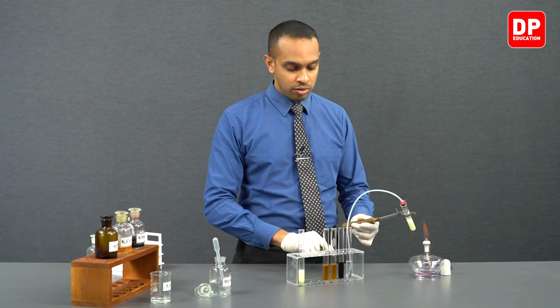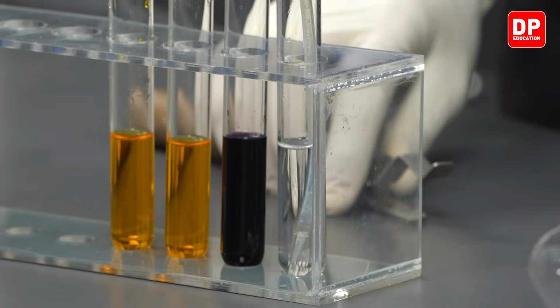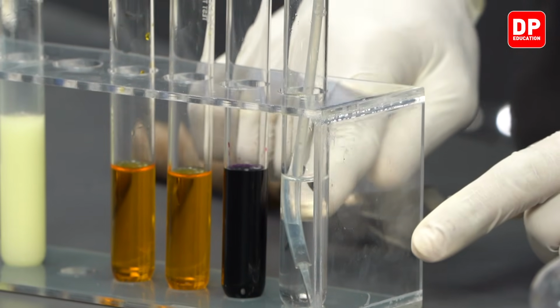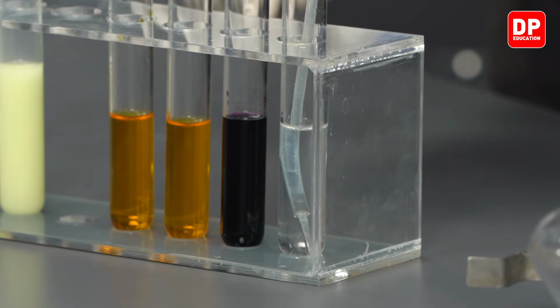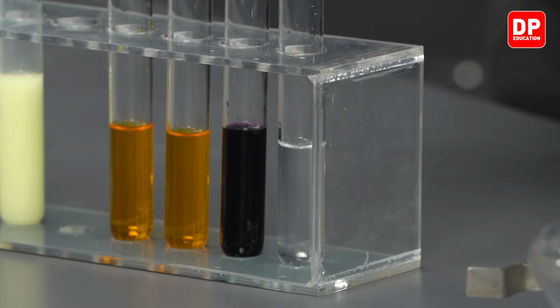Now, students, you can very clearly see the color of this solution has completely turned colorless.